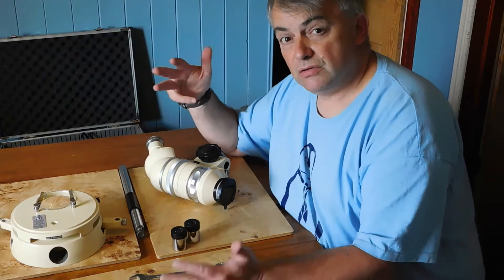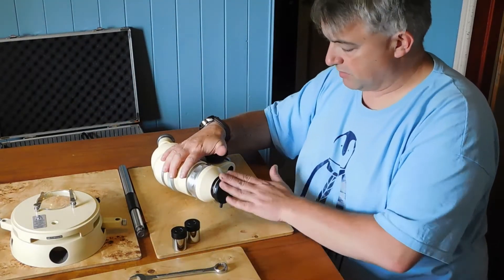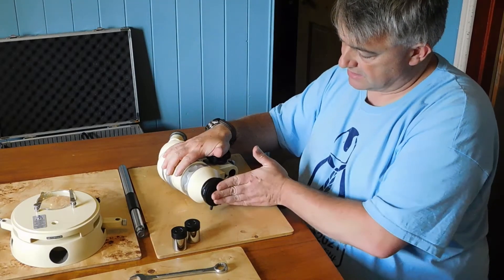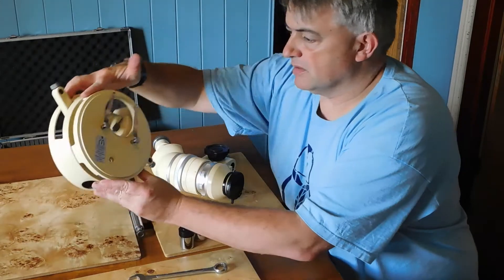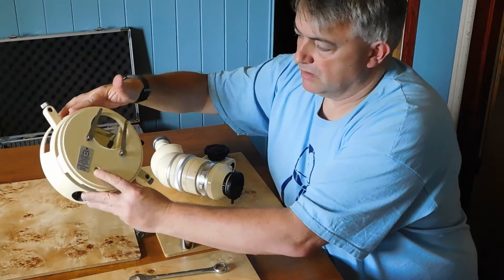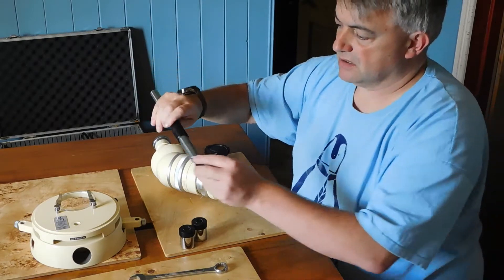Just going to do a video showing you how to assemble the microscope. Got the main part of the scope here with its protective lens cap on, and we've got the base of the scope there with a hole in it where this post actually gets inserted.